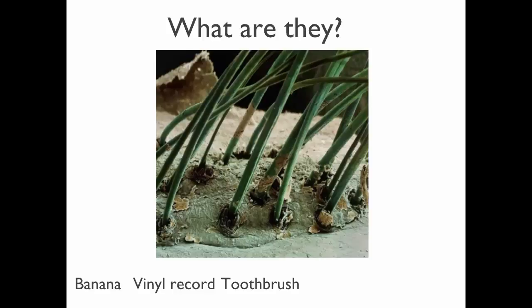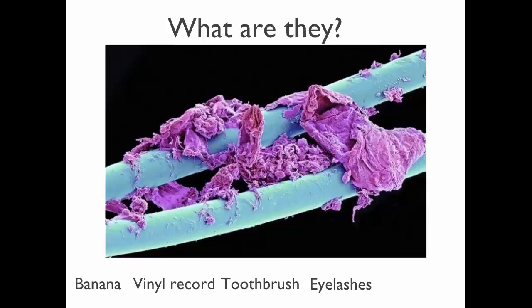I know this. Hair? Eyelashes. Oh, ew. I don't know. Oh. Dental floss. Ew. Someone must have gum stuck in all in their teeth.